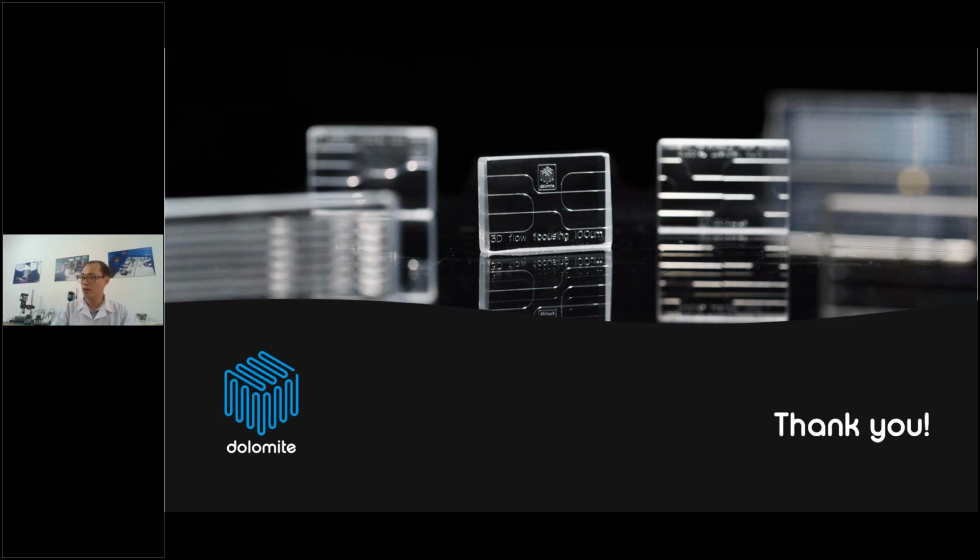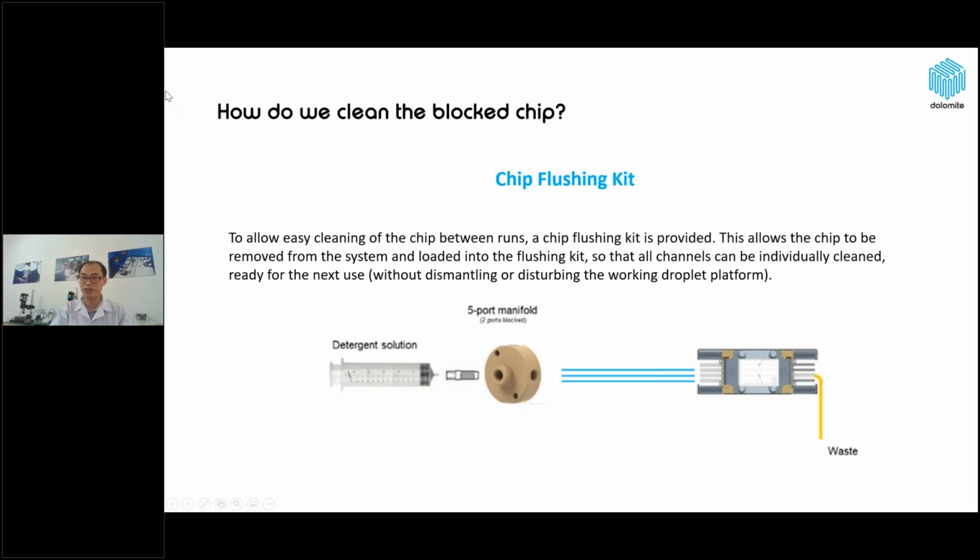So next, we will move to the demonstration. I will introduce you to a chip flushing kit. From this, I can show you how easily you can make chip flushing kits, which can be very helpful for the cleaning step and for avoiding blocking, or that can resolve chip blocking if chip blockage happens.